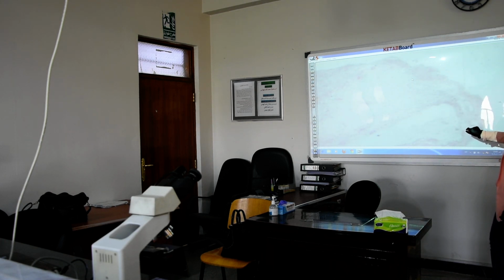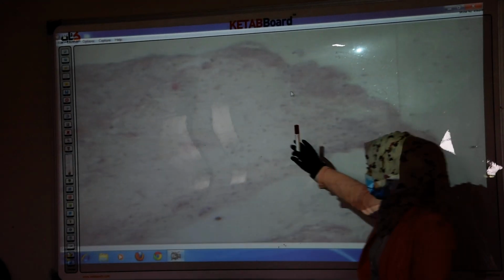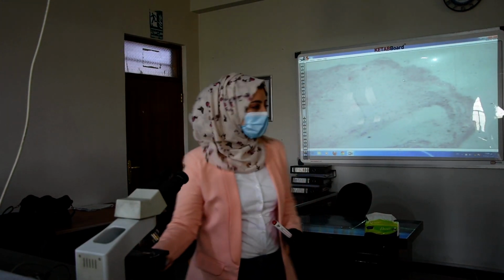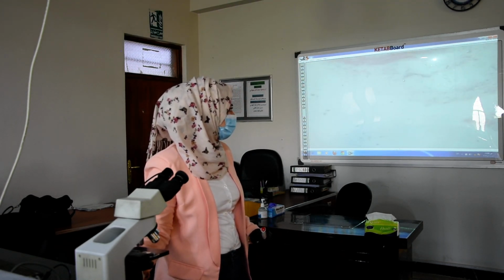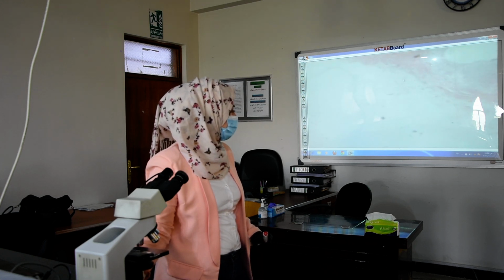Okay, and filled with fibrous connective tissue and based on a fibrous connective tissue called the fibrous skeleton. That also contains three types of layers: annuli fibrosi, septum membranosum, and trigonum fibrosum. And these semilunar valves are based on the trigonum fibrosum. Okay? All these are a semilunar valve.